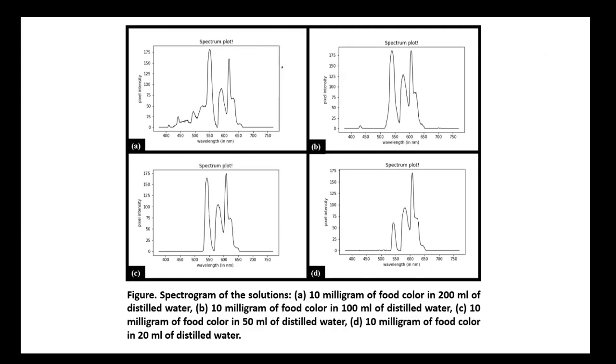This is the wavelength spectra of the color which we obtained from the image processing based spectrophotometer.